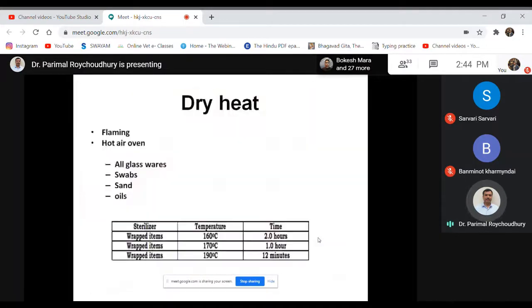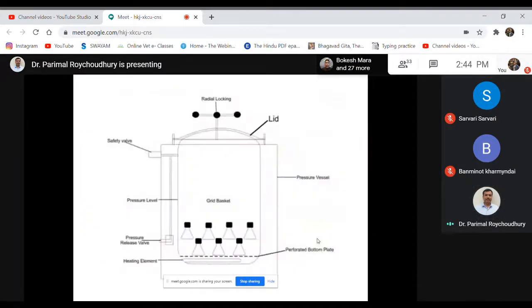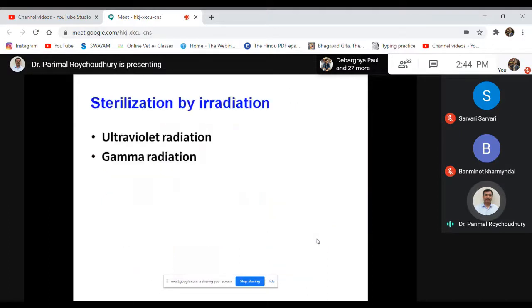One is the dry heat, another is the moist heat type of sterilization. Most of the time we'll be doing this technique. Whenever we prepare any media, we sterilize them by autoclaving, and glasswares we can prepare by the hot air oven method of sterilization.